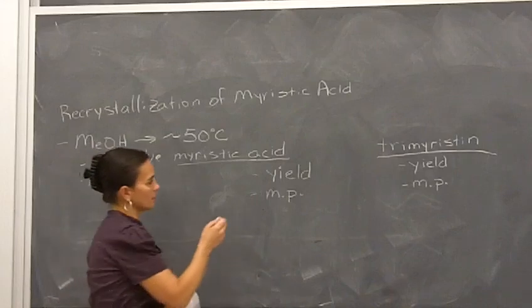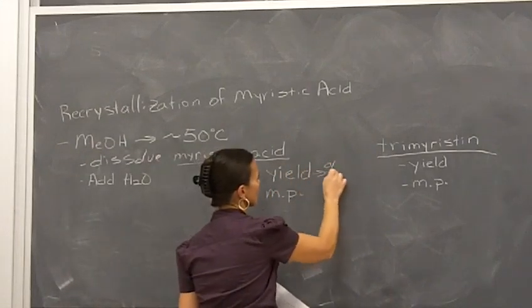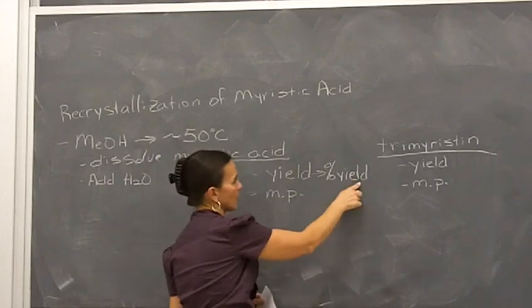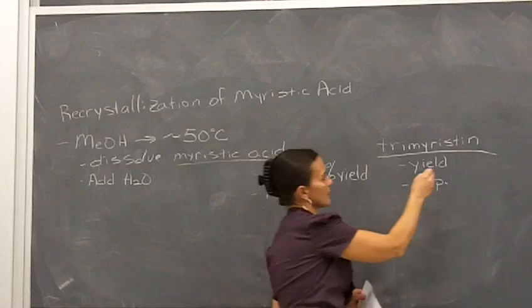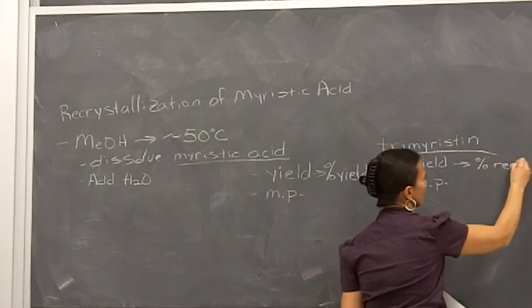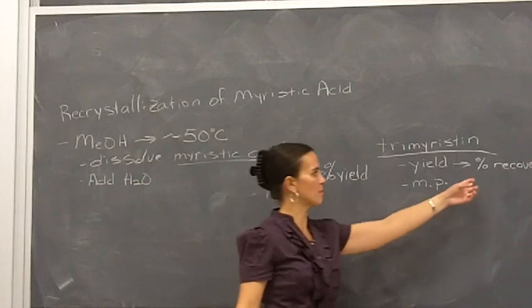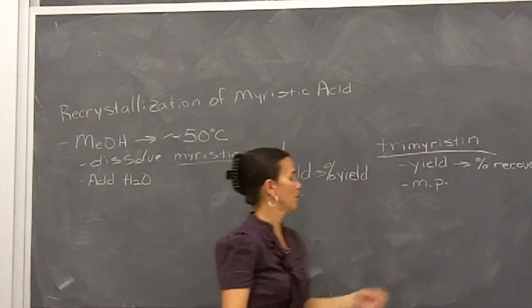Now for yield, remember that your myristic acid, that is an overall percent yield that you will end up calculating, okay? So you will have your yield in grams, and then you will go on and calculate a percent yield. The trimyristin, what you calculate beyond just the yield in grams is the percent recovery, okay? So remember here we're just comparing the yield to how much nutmeg we started with.